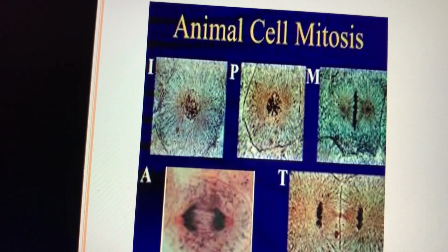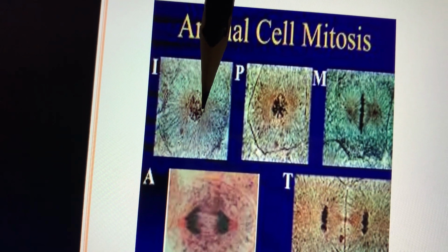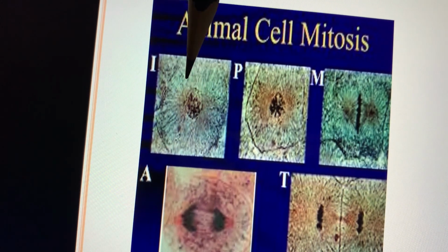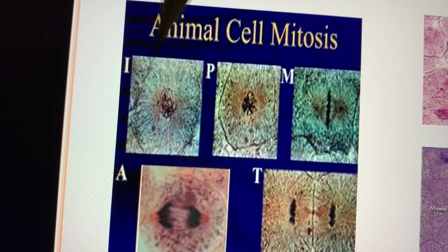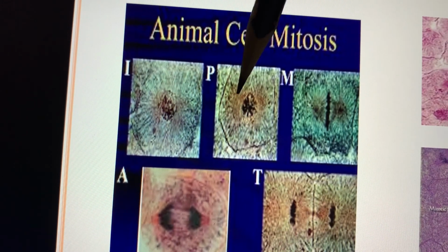Again, look at prophase. Look how it becomes like dots inside the nucleus. Also, the nucleus will enlarge and the nuclear membrane will be removed. This is the cell membrane. It becomes very duplicated. So this is interphase, prophase, but I don't need you to recognize interphase.